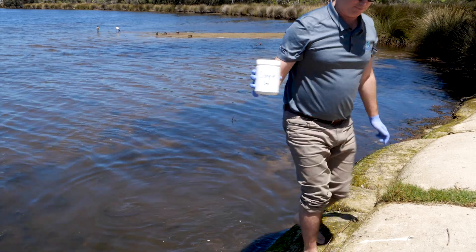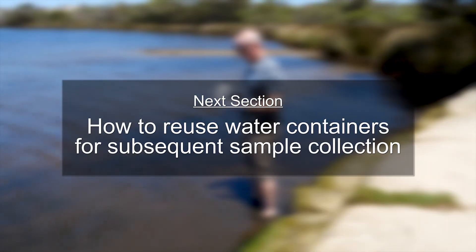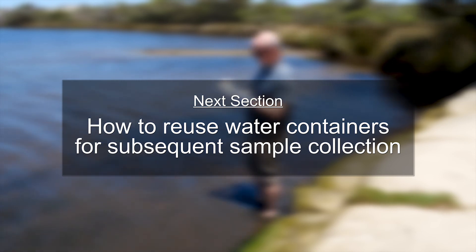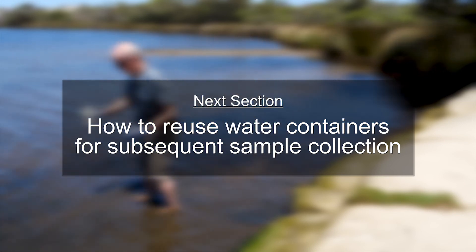Cap the container tightly and immediately place it on ice. Now, in the instance that you have taken the water sample and filtered it, this section describes how to clean and sterilise the container ready for a new sample to be taken.